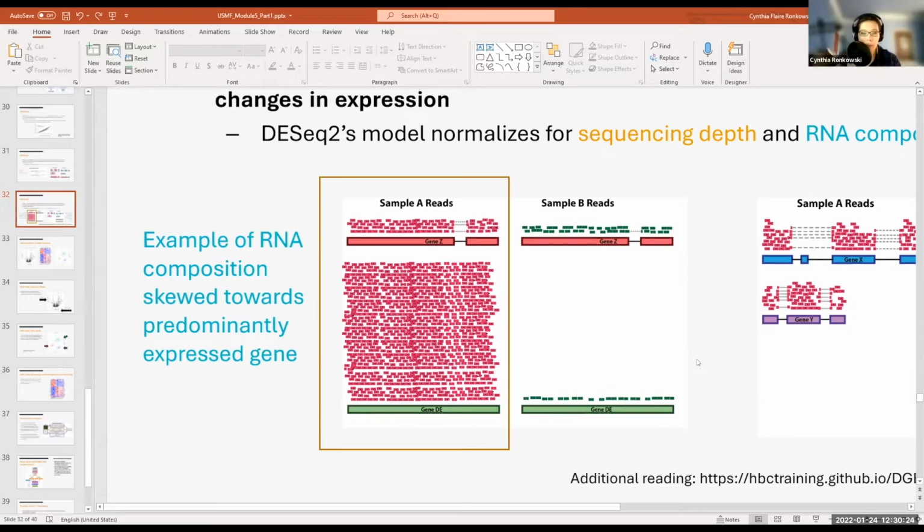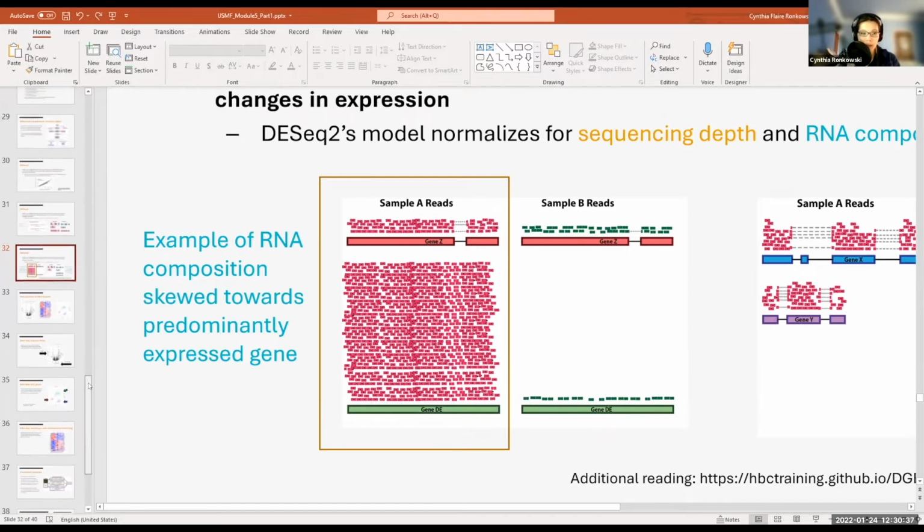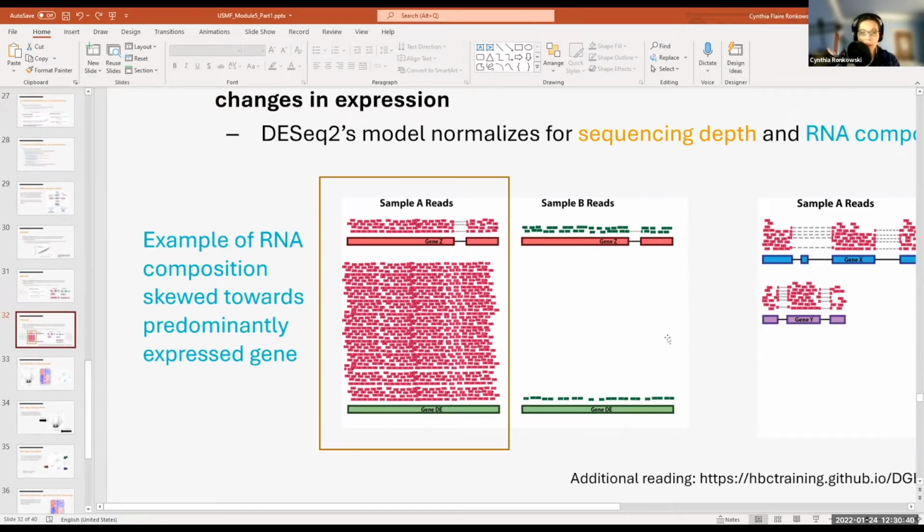Probably in that case the better term would be coverage, because depth can also refer to depth of sequencing in libraries, but that's a different thing. The point is coverage is probably the best term there. Okay, I understand. Yes, more or less. Thank you. Anything else? No, meanwhile, this one was just to understand the data. Thank you. Happy to help.